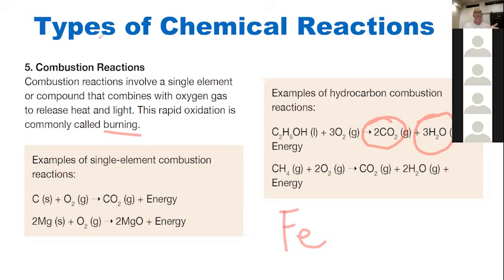In fact, magnesium, we should be careful with the magnesium. Magnesium, if that comes in contact with a flame, burns with a tremendous amount of light and very, very high temperature. So yeah, magnesium burns tremendously well. So does aluminum, for that matter.